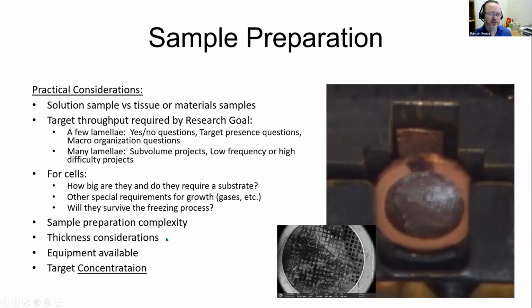Again, thickness considerations are important. If I have something in solution, that's not as big a problem unless my cell is huge, and then that can become a problem. And what equipment, this is often a big thing, what equipment do I have available? There are very few facilities with every piece of technical equipment that you could have.